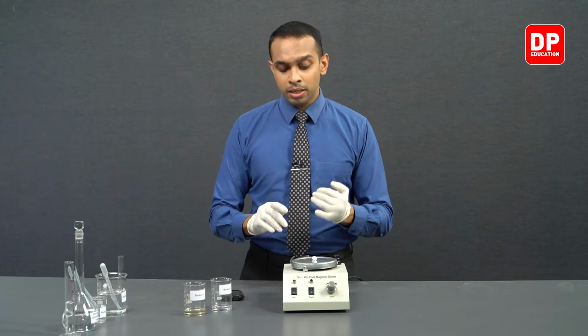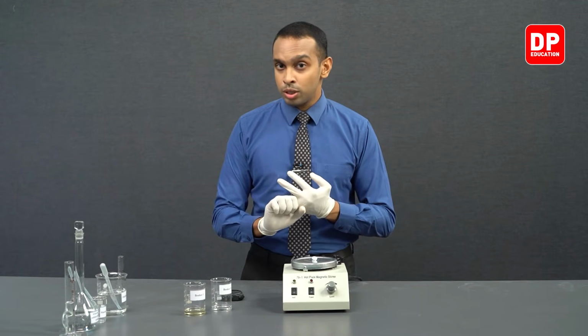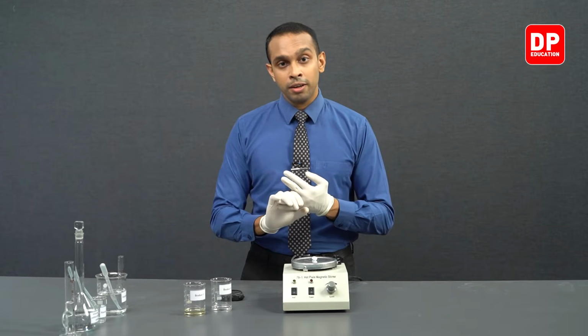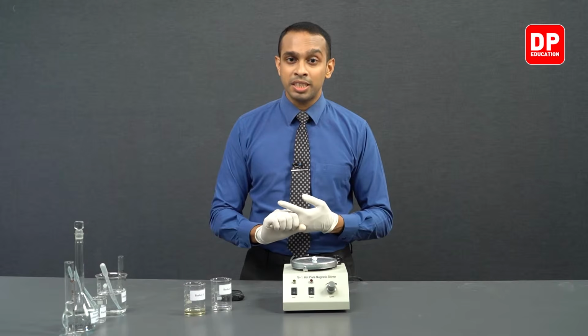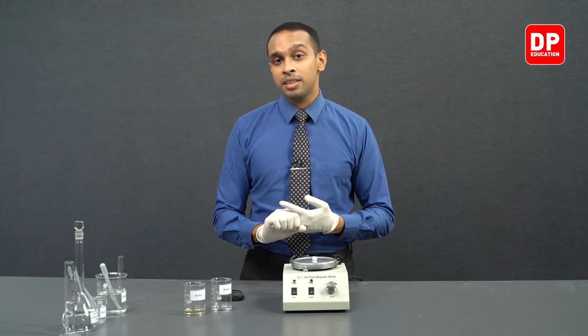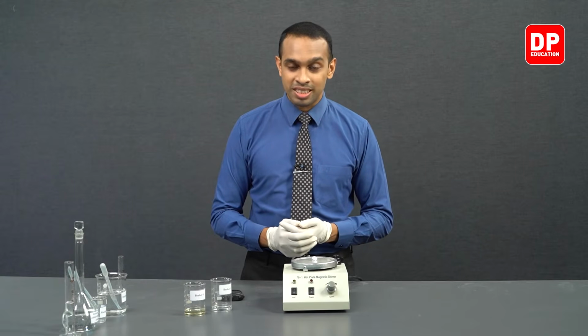So keep in mind, potassium iodide and sodium thiosulfate volumes do not change in the first 5 reactions we will be carrying out here. However, we will be changing the Fe3+ ion solution's volume that we take into these reaction mixtures.